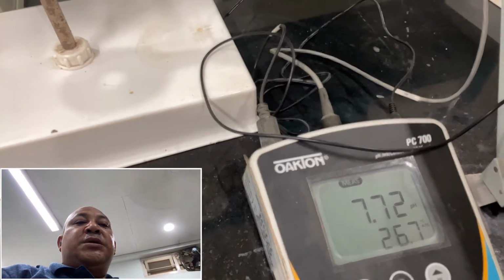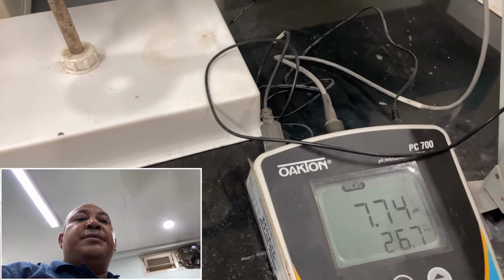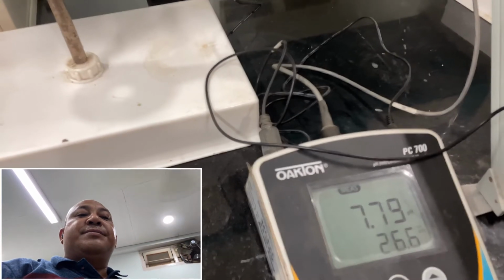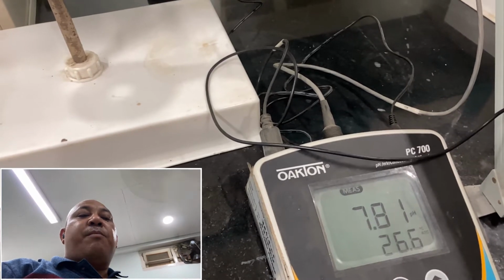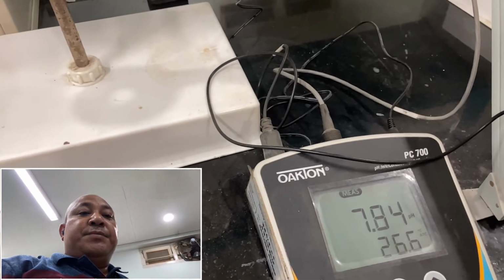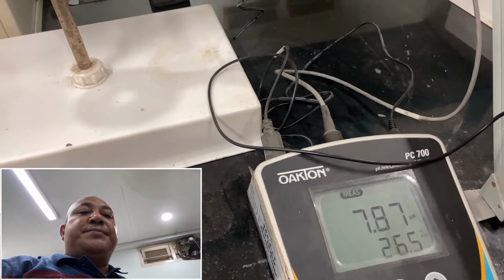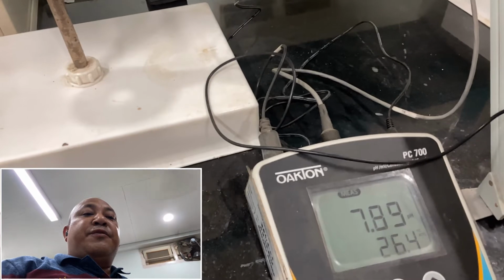So pH is 7.72. Slowly it's increasing. 7.74, and then 7.77. Let's have some patience. 7.79, 7.81. So the fluctuation is very small. Anyway, we can consider this to be 7.85. I feel so, if the accuracy is not much required. I think because of the fan, fluctuation is there. Fine.